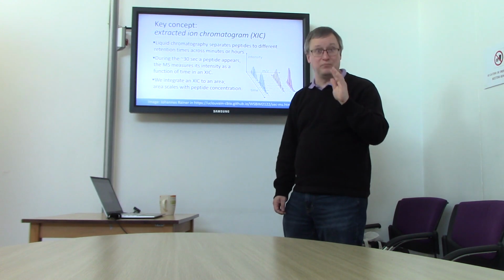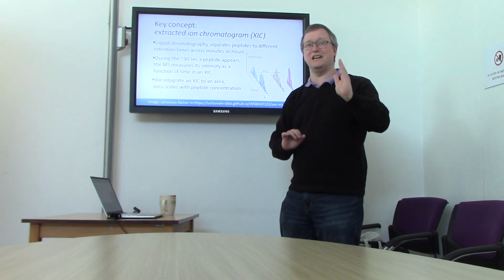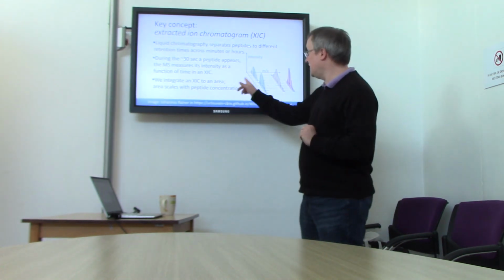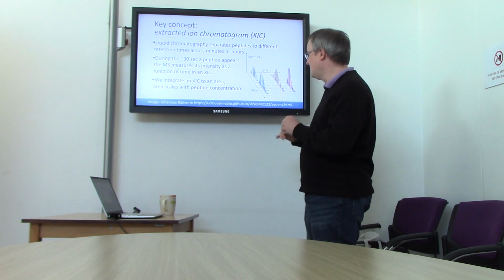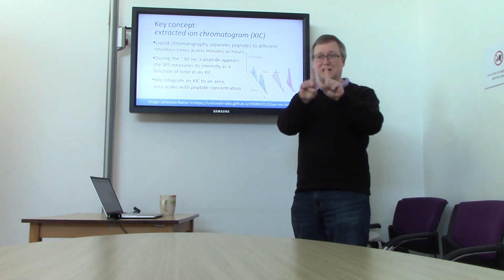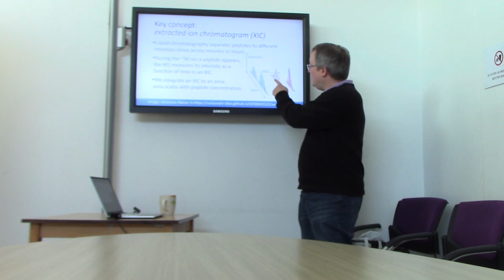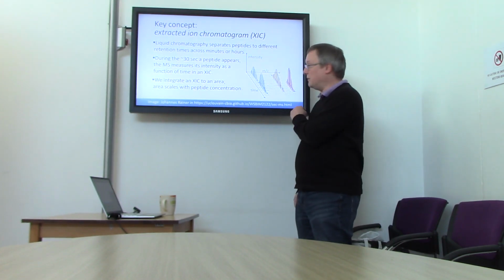This is assuming that you can distinguish this peptide's ion from all the others by mass to charge. If you're doing this in an ion trap, forget it, it's going to be a mess. But in say, FT style, Orbitrap style instruments, you have really good resolving power. And so ions may be very close together in mass to charge space, and you can still tell them apart on each mass spectrum. So here we have kind of a good shape for what a peptide ion usually appears to be.